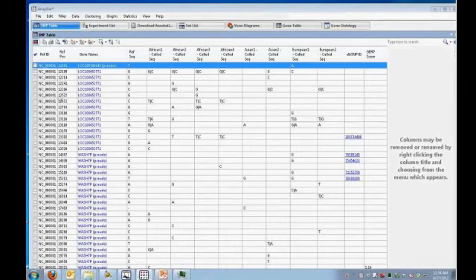And you can see the main difference here is now we have our, here's chromosome 1, we get a reference position, we get a gene name, the reference call, excuse me, and here's our samples, and here's the called sequence in each sample. And so we're actually getting a summary then at the reference position.